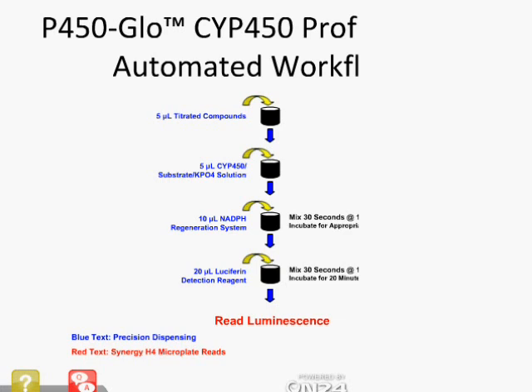The wells of the plate are incubated at room temperature for an appropriate time depending on the substrate that you're using. The luciferin detection reagent is then added. The plate's mixed and incubated for 20 minutes to allow the luminescent signal to stabilize, and then the luminescent signal from each well is detected using the Synergy H4.